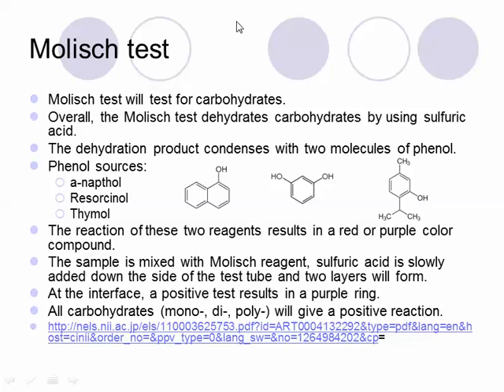So it dehydrates the carbohydrate, and it removes the water by using sulfuric acid to do so. And then this forms a product. And we take that dehydrated product and we react it with phenol.